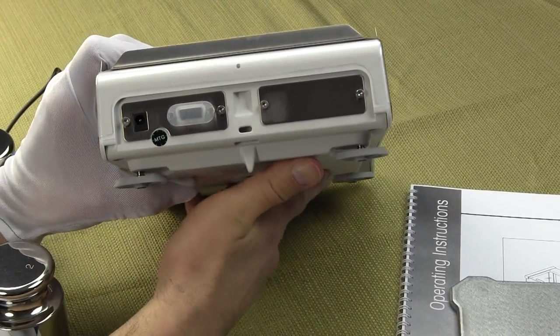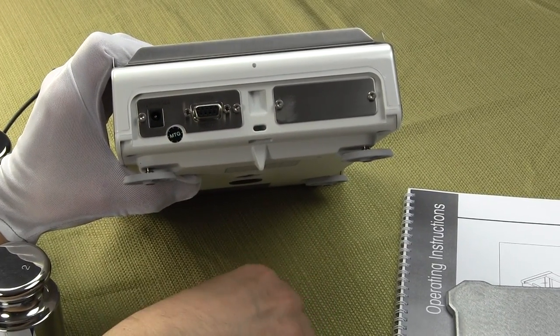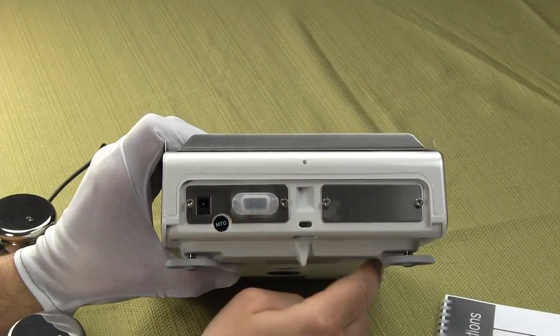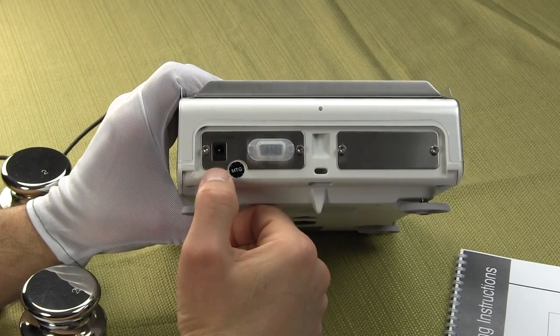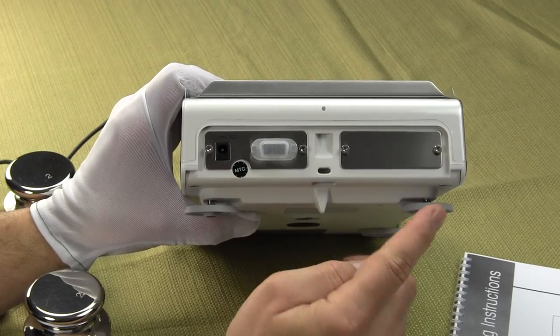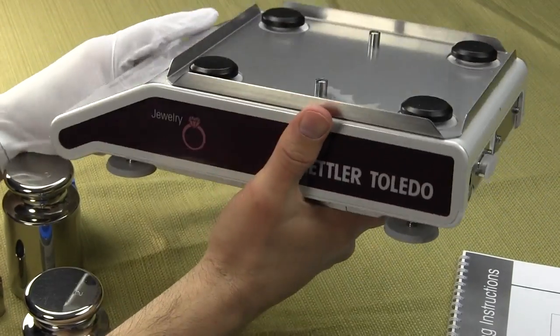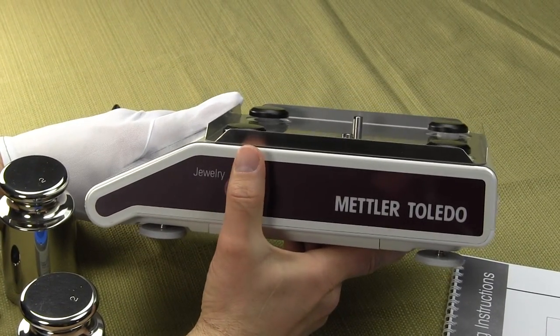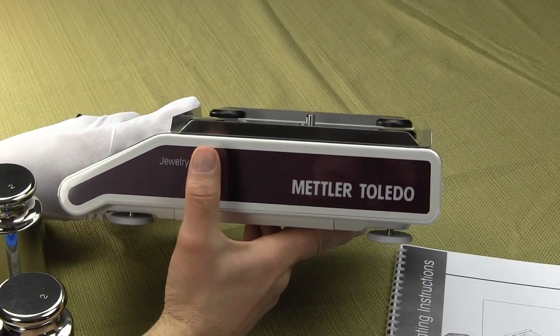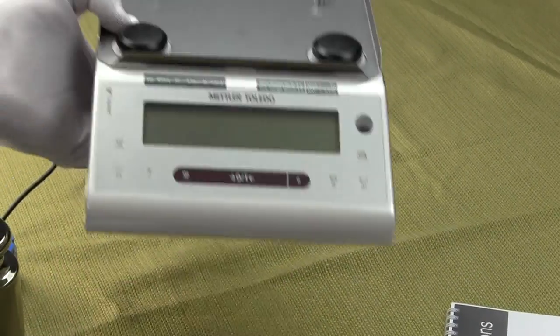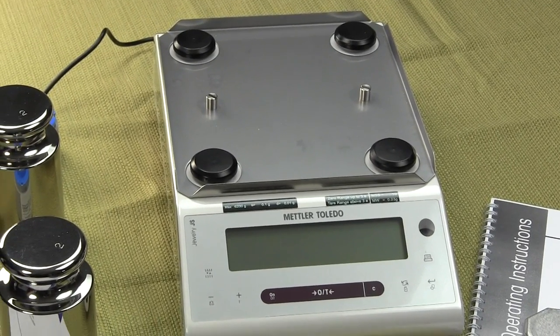On the rear of the balance, you have RS-232 interface. You could use this for an auxiliary display, which is an option. A lot of states now require two displays. You could also go to a computer if you had your software. This is your power jack. There's also a port over here for a secondary RS-232. That is an option. You can see on the side of the balance, the prominent Mettler Toledo name. And you can see the ring specifying. This is for the jewelry market. So this is a top of the line balance.